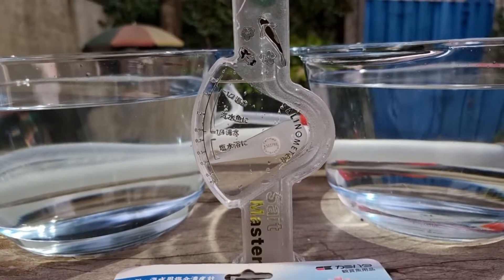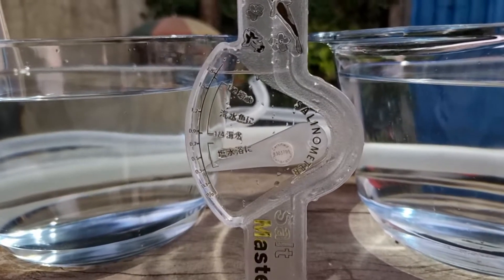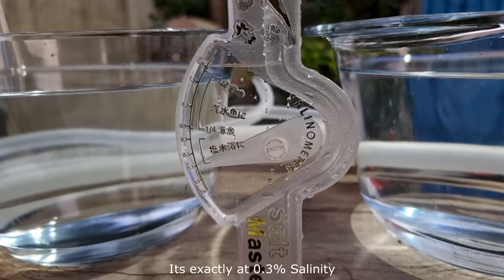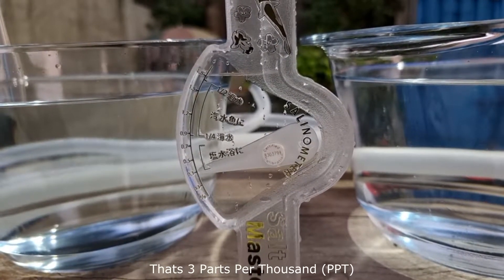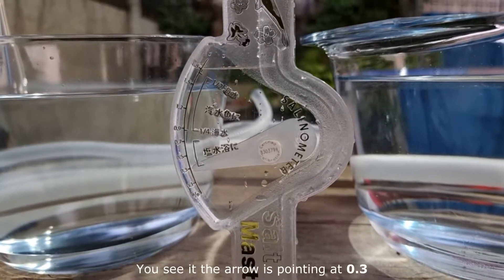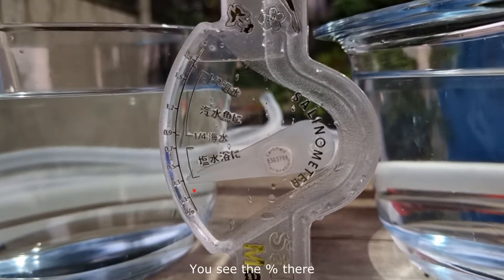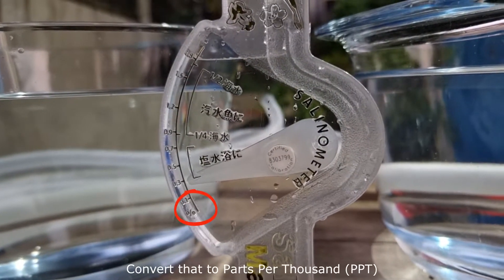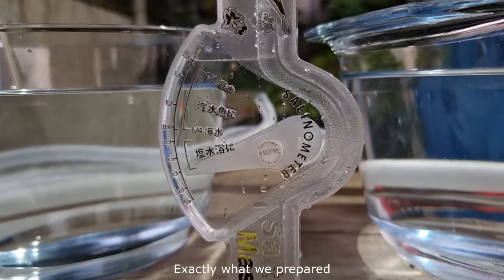I think that's it — let me check it closely. We have a good reading, guys. It's exactly at 0.3% salinity. The arrow is pointing at 0.3, and you can see the percent sign there — that means 0.3% salinity. Convert that to parts per thousand: that's 3.0 parts per thousand. Exactly what we prepared.